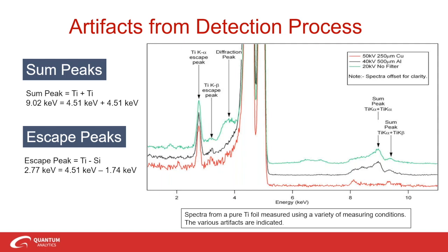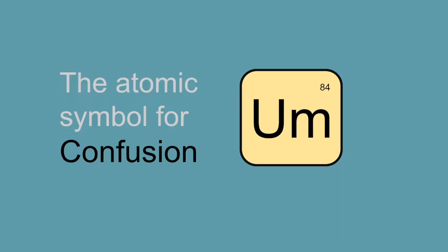So why do I bring this up? Really just to give you some details about things that you need to be aware of. Are you confused yet? Well, don't worry. The good news here, guys, is that most modern XRF technology has very clever software, and this will help you sort through all of this information. What's important for everybody here to know is to take the time to understand what your XRF results mean. So learn some of the tips and tricks that are especially important with sample prep. You can use this to try to avoid some of the pitfalls that may skew your results.